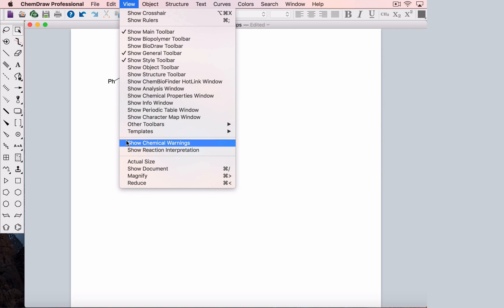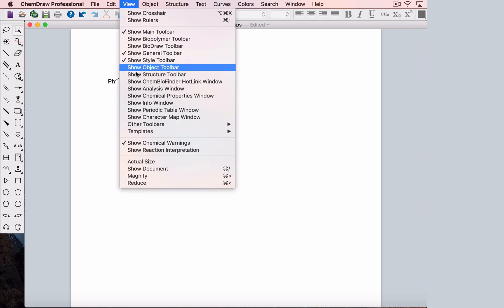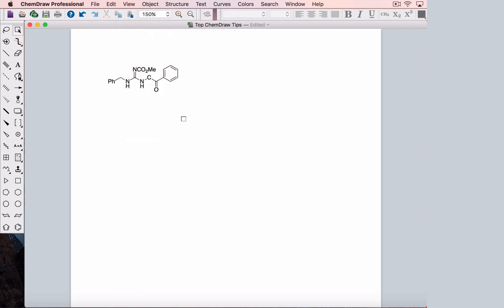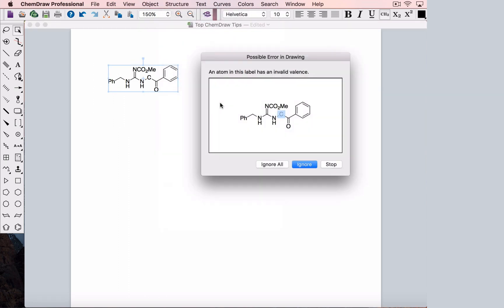You can check structures in a couple ways. You can activate chemical warnings from the view menu and any atom with incorrect valence or charge gets boxed in red. We can also use the structure menu to check our structure. This gives us a little more info about the nature of the error and here it tells us that carbon's valence is not correct.